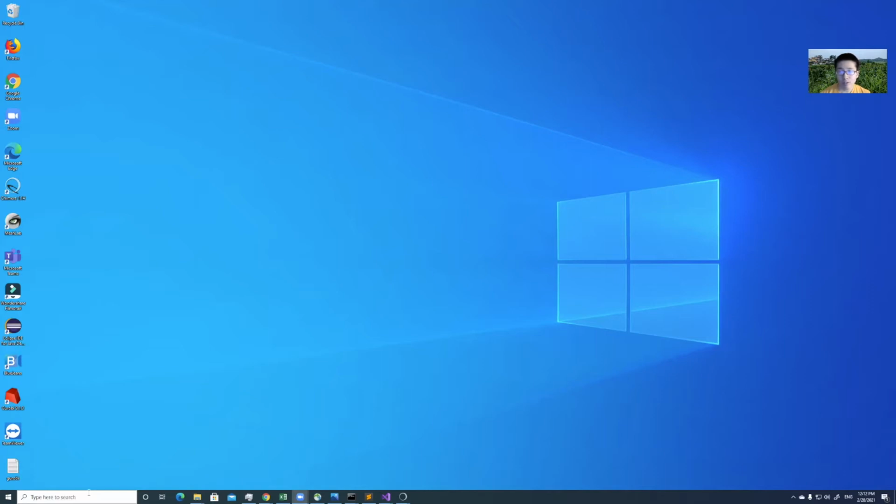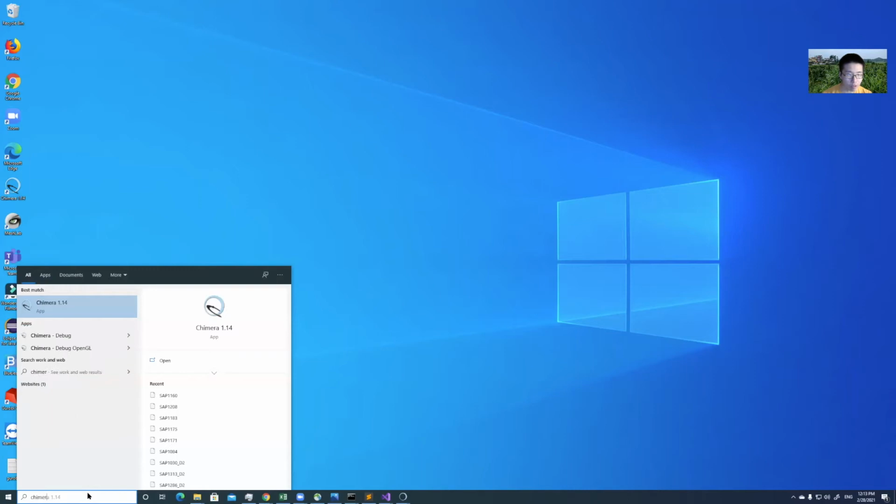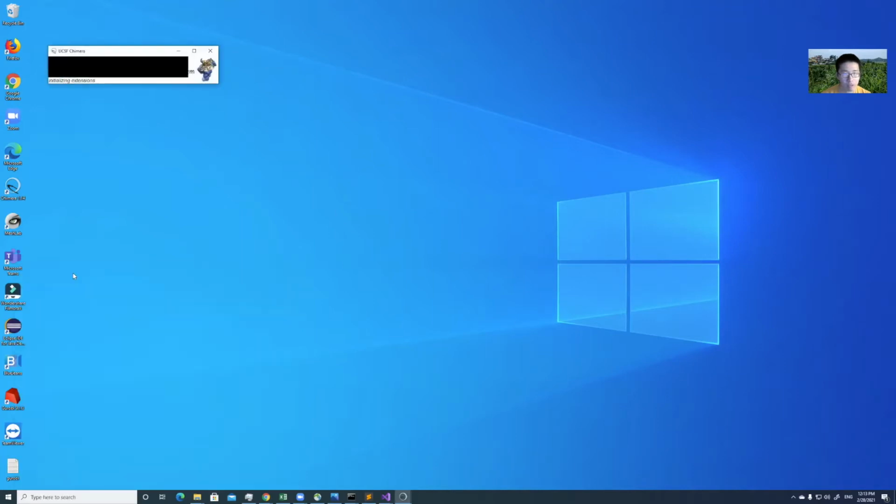Okay, so this video is basically showing how to extract a range of the soil plane using UCSF Chimera. First, we're going to assume that Chimera is already downloaded, so you can basically go to the navigation bar and open it.